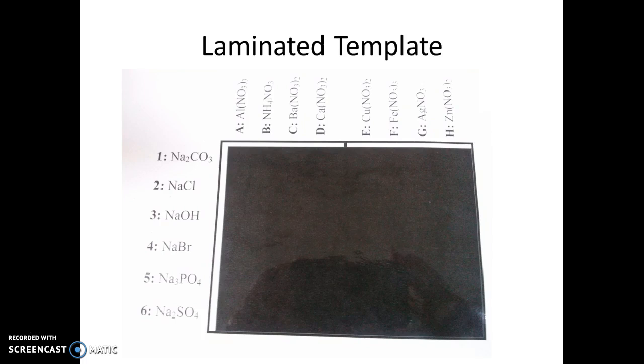You also want to get a laminated template that looks like this. On the laminated template there are chemical formulas for all the reactants that you're going to be using today, and there's also a big black box. The purpose of the black box is to help you visualize any white precipitates that might form as a result of your double displacement reaction, since it can be easier to see those white precipitates against a dark background.